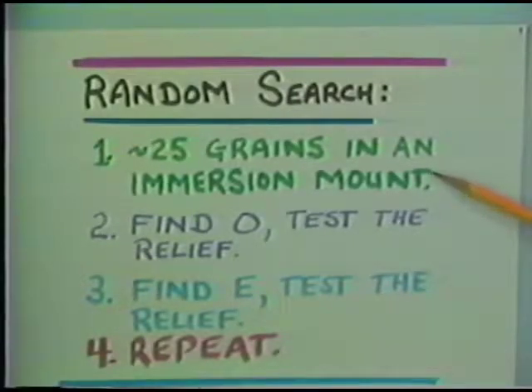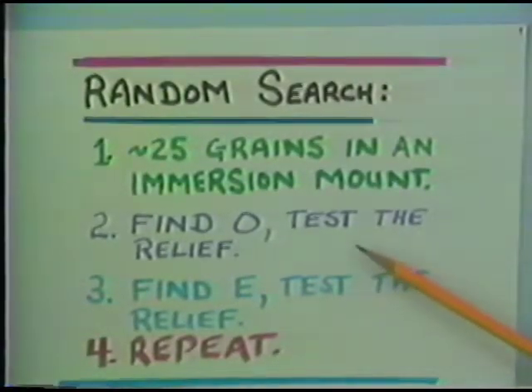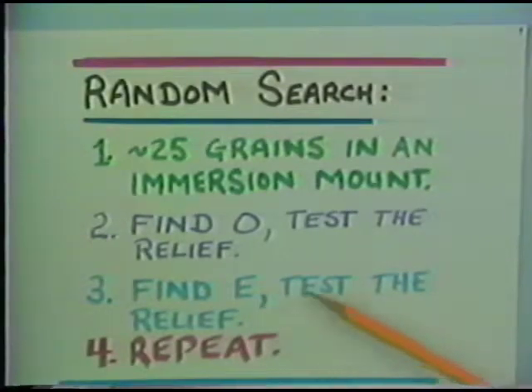So, taking these things in an immersion mount, we find the following procedure. We find the proper grain to measure the ordinary ray, and we test its relief relative to the immersion oil. After finding O, then we find the E ray and test its relief relative to the immersion oil. And then, depending on the results of steps 2 and 3, we repeat using a different immersion oil to see how the results will change. And we repeat this in an educated fashion, taking advantage of our previous experience.